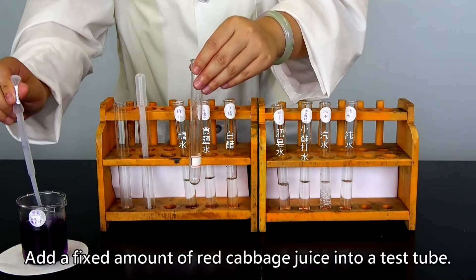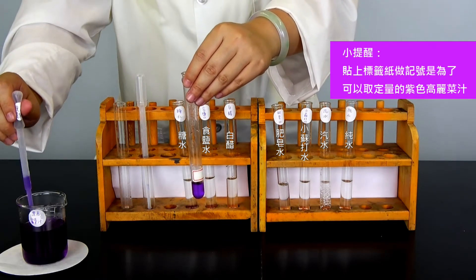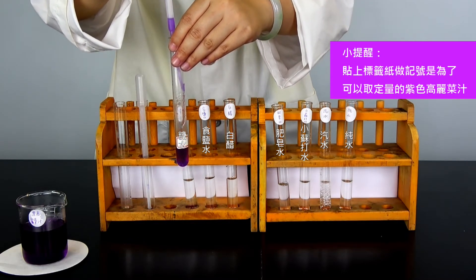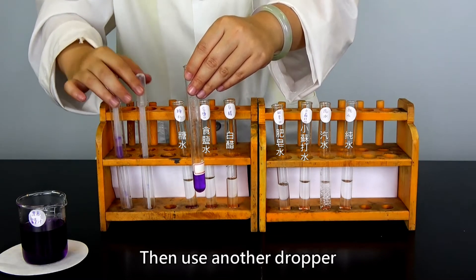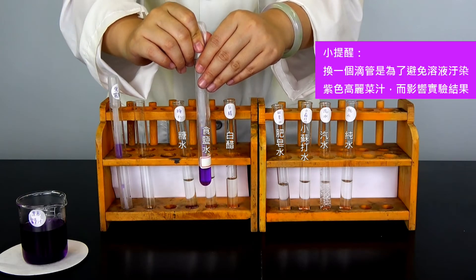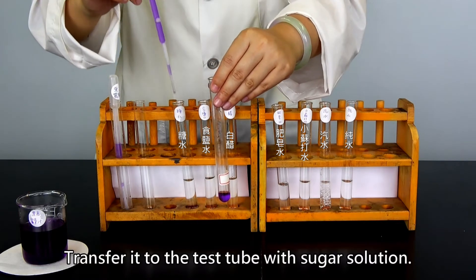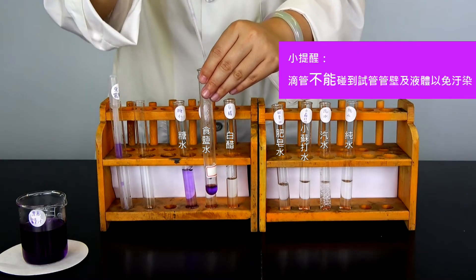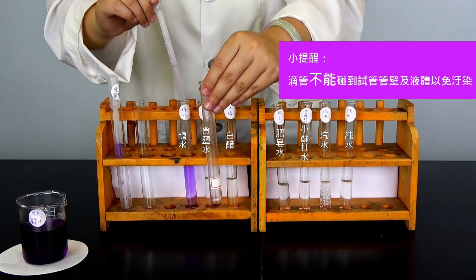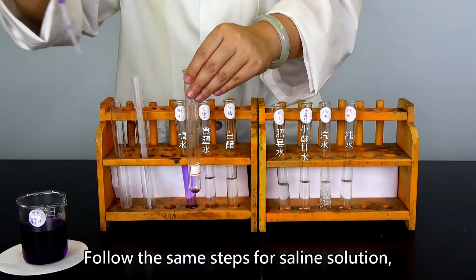Add a fixed amount of red cabbage juice into a test tube, then use another dropper to suck all of the red cabbage juice. Transfer it to the test tube with sugar solution. Follow the same steps for saline solution.